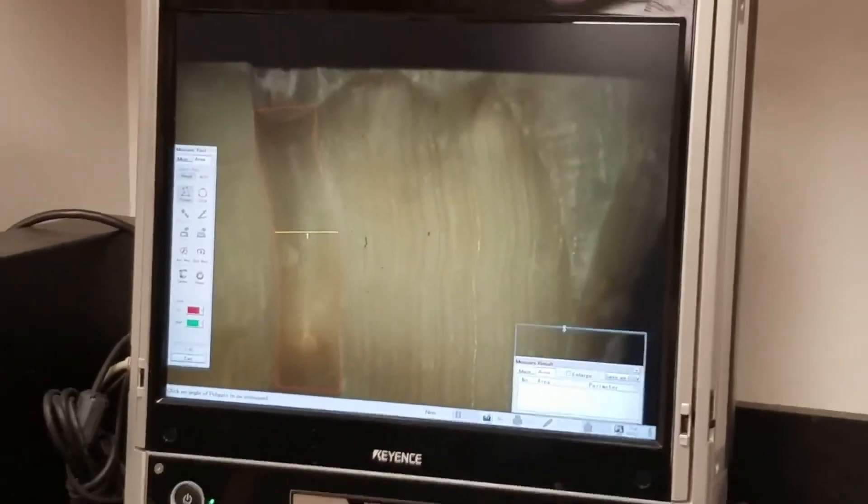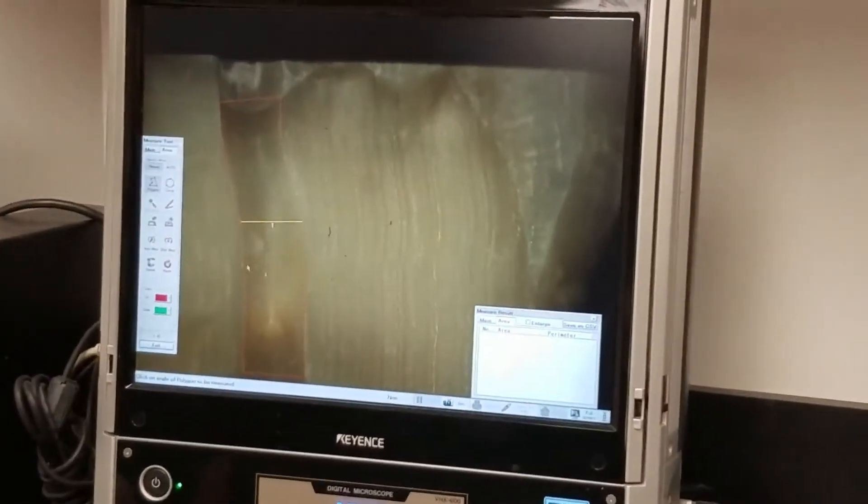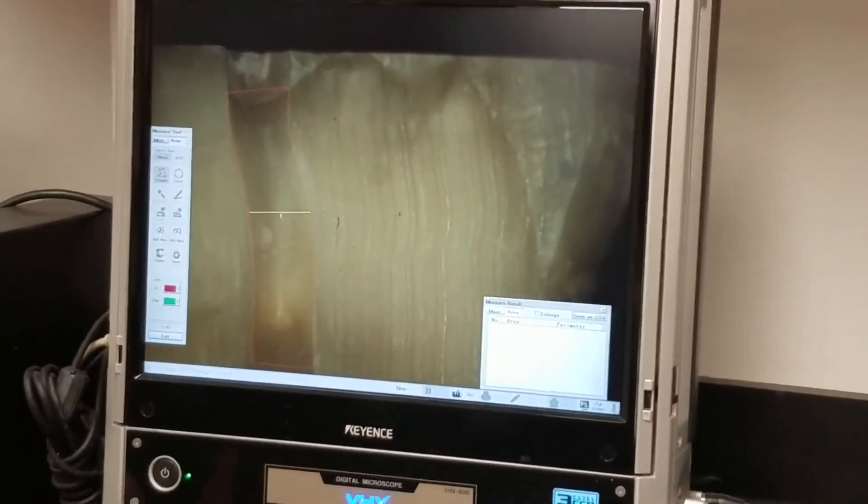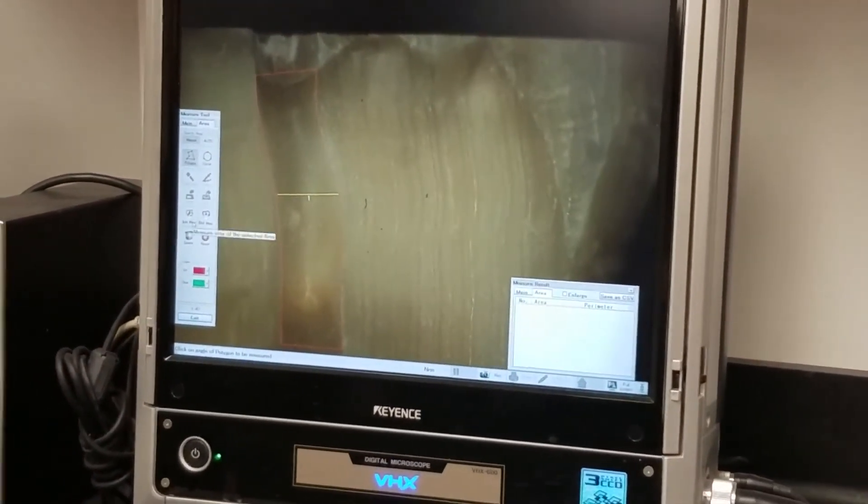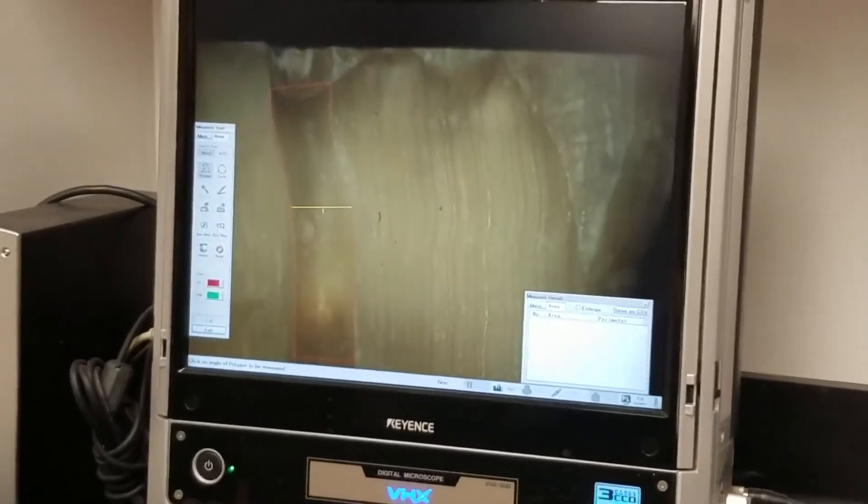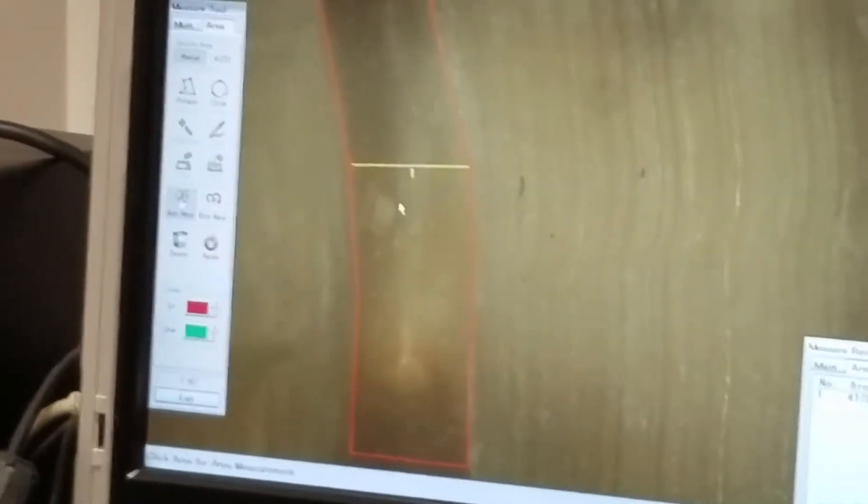And so now I've outlined it. Now I just press, I think I go individual measurement and I click inside of here. And it tells me the area inside of here and the perimeter here.